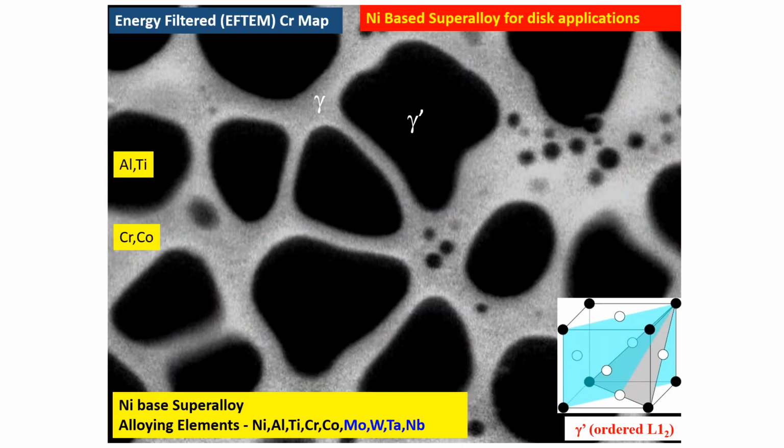So this is a typical nickel-based superalloy microstructure. The dark areas are the hard precipitates, gamma prime precipitates. Usually nickel-based superalloys have several elements, at least eight elements they add, depending on the temperature, stability, and where they want to use this. Mostly the gamma prime precipitate, which is the darker regions shown in the micrograph, is where the strength actually comes from. The strength also depends on the distribution, size, and the volume fraction of those precipitates. So this is the microstructure for this alloy that we have been examining. Next slide.